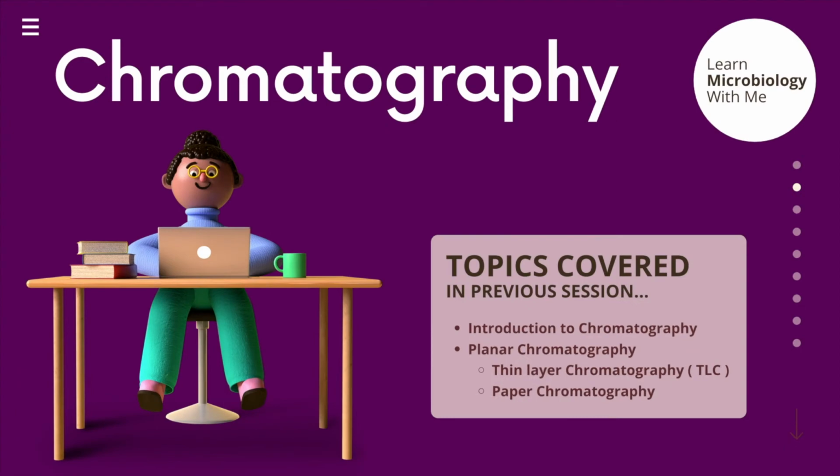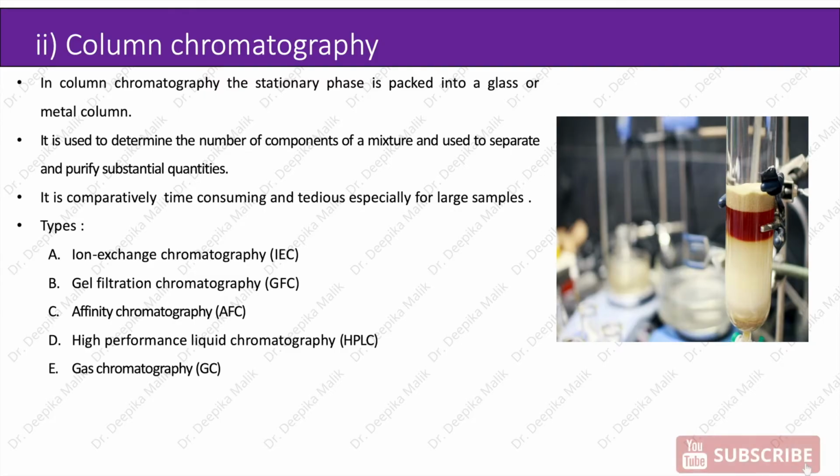In the first part, I gave you an introduction about chromatography, its different types, and a detailed discussion about planar chromatography, which included thin layer chromatography and paper chromatography. Now coming to the second type of chromatography based on the methods of holding the stationary phase is column chromatography.